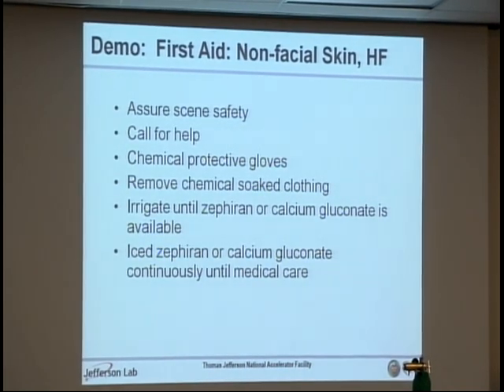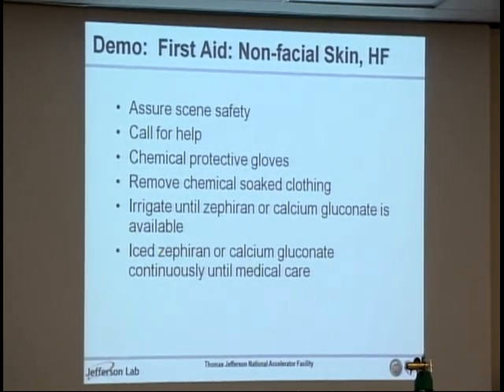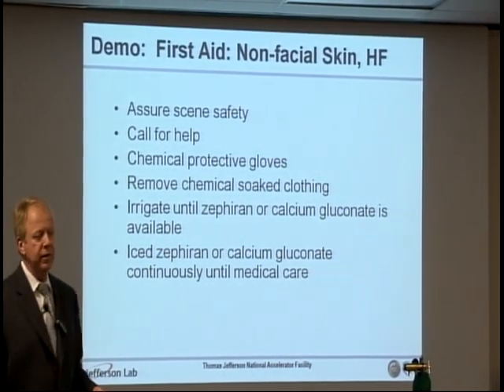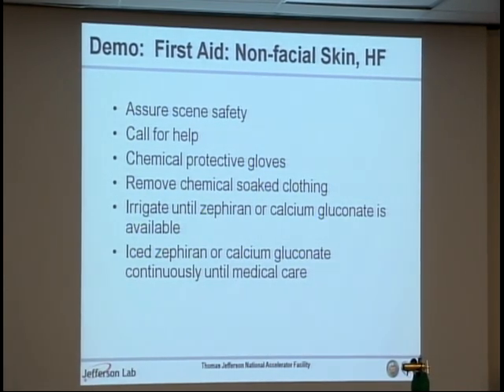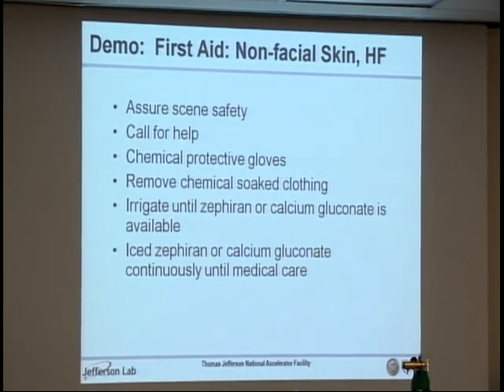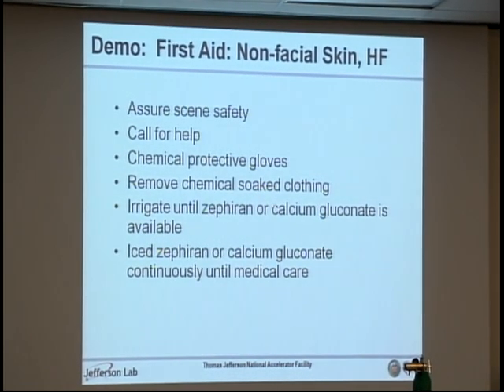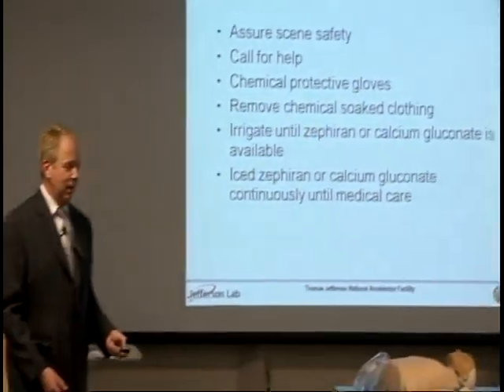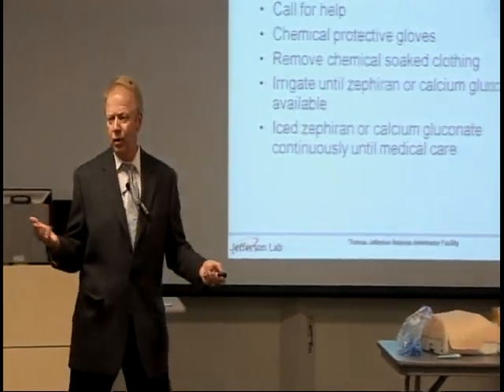Now we're going to switch to everything except the face. The only difference here is that Zephyrin becomes one of your options if you want to use it. Otherwise it's all the same: assure scene safety, put on gloves, remove anything that has chemical on it — any clothing. If in doubt, take it off. Then irrigate with water until somebody brings you either Zephyrin or calcium gluconate. If you happen to switch from one to the other, there's no harm in that — nothing wrong with using them both.